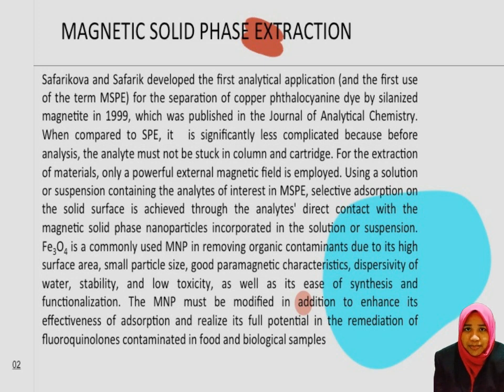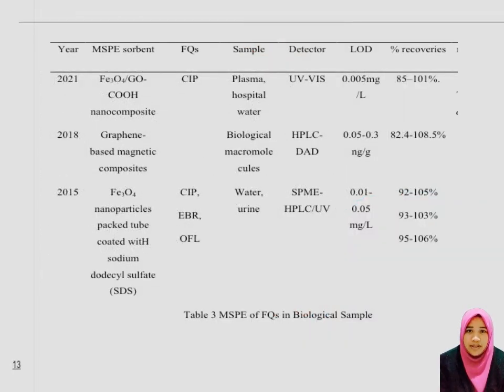The MNP must be modified in addition to enhance its adsorption effectiveness and realize its full potential in the remediation of fluoroquinolones contaminated in food and biological samples. Tables 3 and 4 summarize magnetic solid phase extraction of fluoroquinolones in biological and food samples.